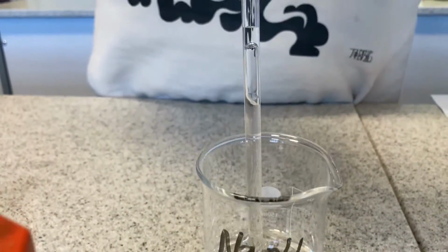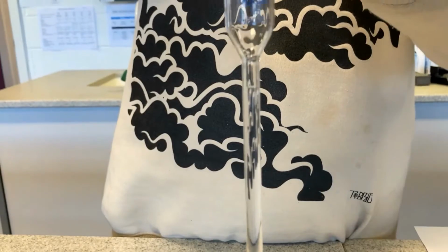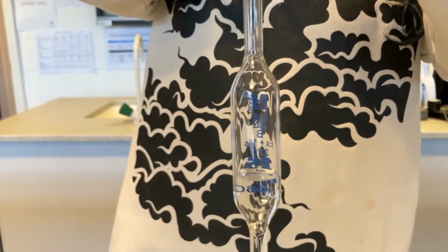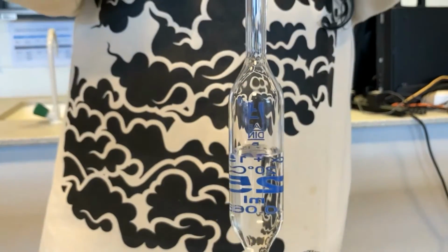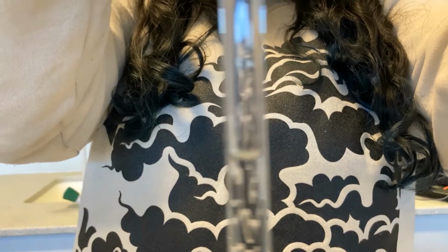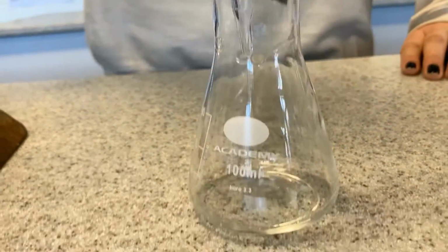We're going to draw the liquid up. Oh no, I've got a bubble already. Sad times, hopefully it pops. This is the bit that takes forever. So that exacts it. I think I'm literally just on the meniscus and I'm going to transfer it to a conical flask.